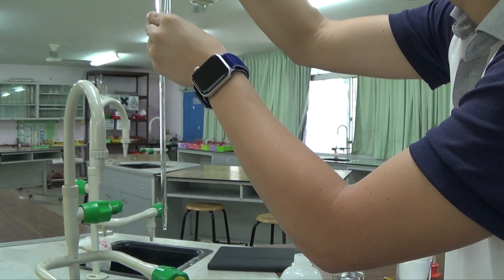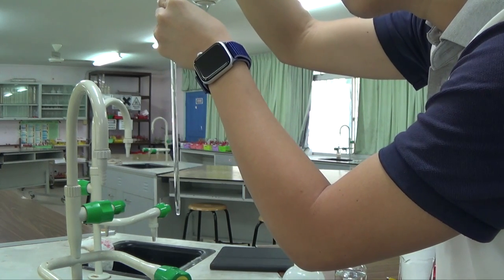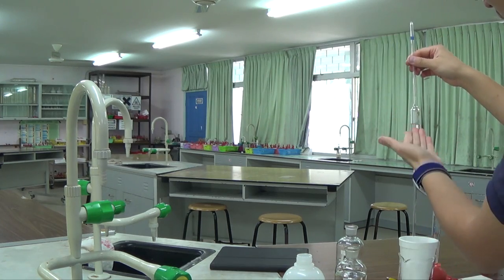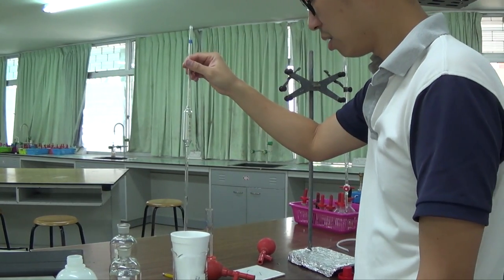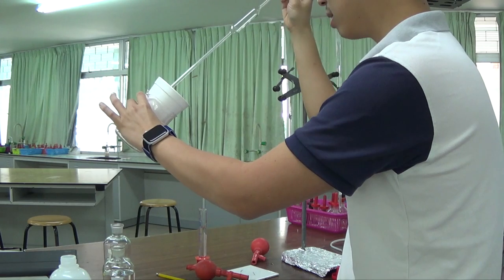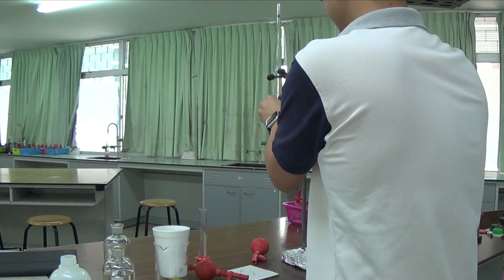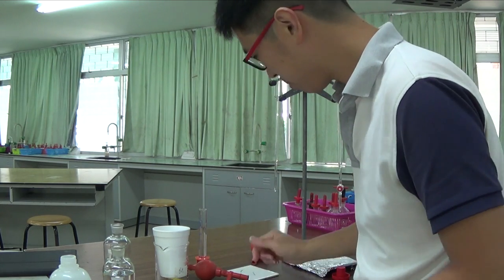Oops. So, need to be careful. So that's 25.0 cm cube. Then I inject it, but I also take out the pipette filler, so it goes down a lot faster without the pipette filler anymore. Okay, so let gravity do its job. Once the last thing comes off, tilt it at an angle. This is not glass on glass, like titration, so just tip it 3 or 4 times, and then we'll get rid of the last few drops in the pipette. Okay, support your pipette again, because you don't want the pipette to be left rolling down on your bench, it's dangerous, okay?